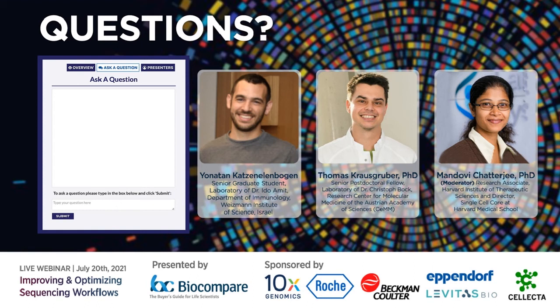And regarding the platform we use, because we can do it with the plate-based technologies, we can pre-select them. If it's very rare and you just run it with the microfluidics technique, you sometimes won't have good representation of your desired cell type. So when you use plate-based technologies, it's quite optimal when you want to target some rare population, because then you can isolate them from the tissue with flow cytometry.